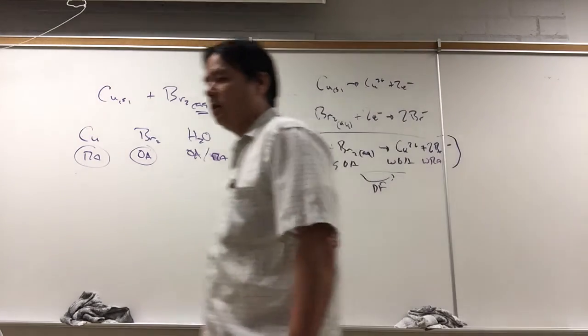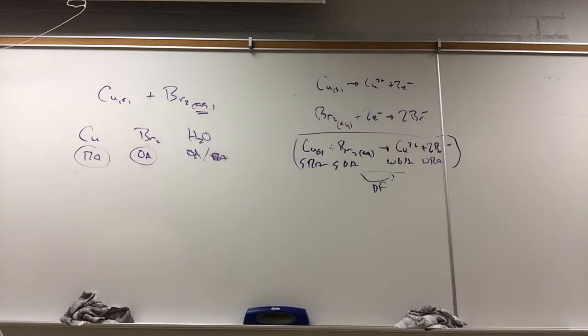Now what happens next in the procedure? You split the product solution. You see it? What does it say?